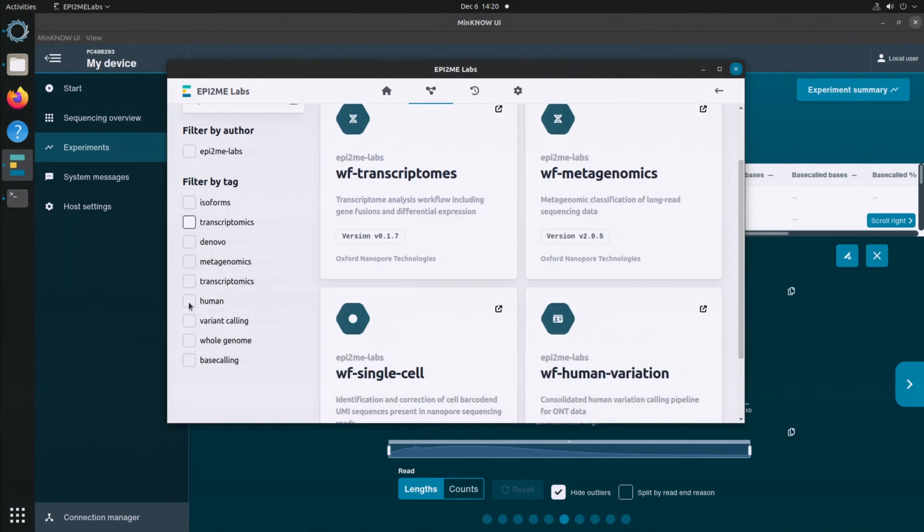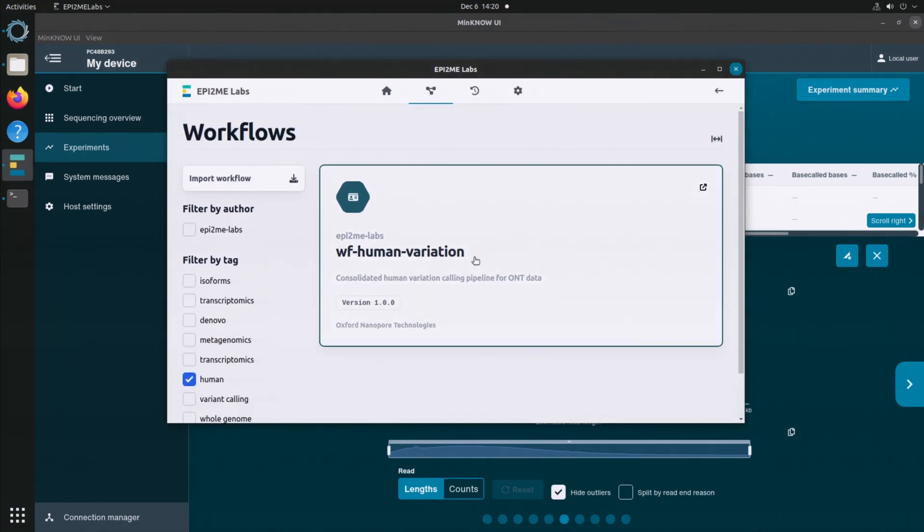Here we're talking about a human end-to-end workflow. Let's have a look at WF Human Variation — our workflow for looking for SNPs, structural variations, repeat expansions, and methylation. It can do it all.